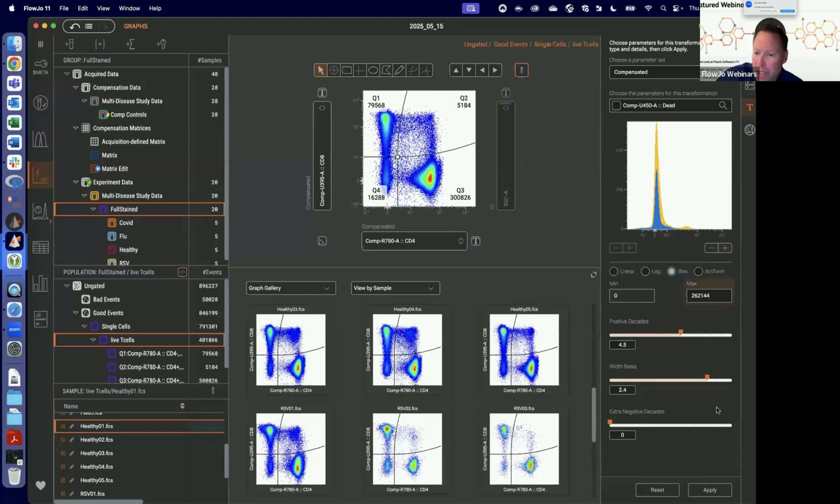Okay. Question, can we make the plot where we are working bigger? Can we have more than one plot open in V10? So one primary plot, lots of satellite plots. Right now we don't scale that one up. That seems like a good idea to do for the future, which requires some additional resolution. Good questions, Edgar. Okay, let's hit our CD4s.